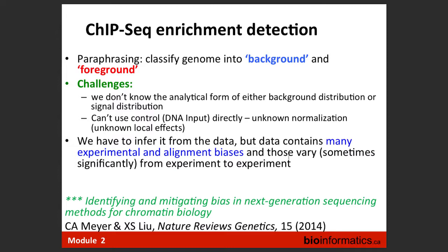If it is like two A's, we will question it. But there is clear statistics; in this case it's binomial, it's like a dice. We honestly throw a dice with two numbers and we see how many times it's A, how many C, and we can assign a p-value and have a conclusion here. The same with RNA-seq. We have a very small part of the genome, less than 1%, say, which is coding, where our reads are supposed to fall. And then we have some background, of course, but we are just counting reads in our exons. And everything we count we essentially use for quantification of expression and comparison between libraries.